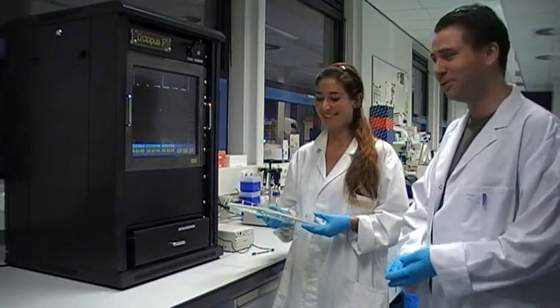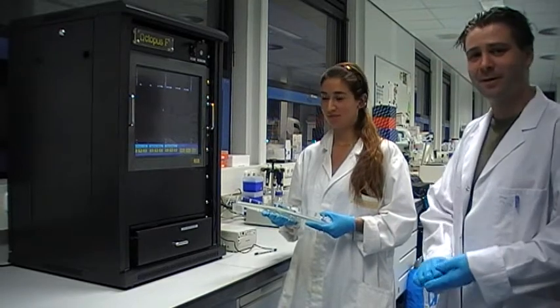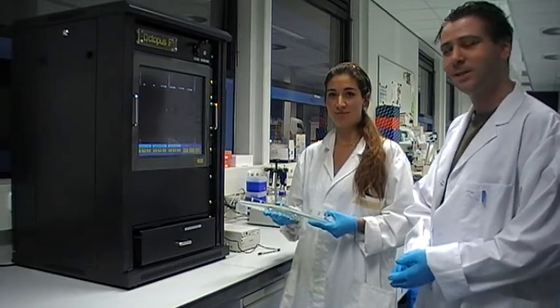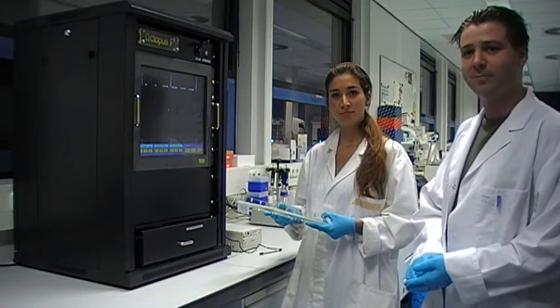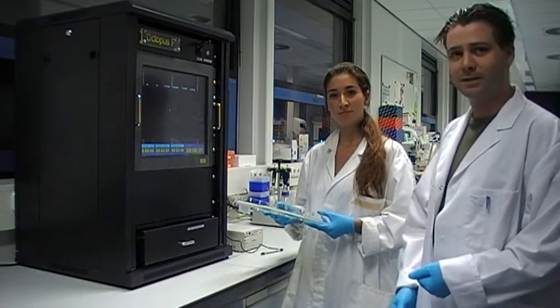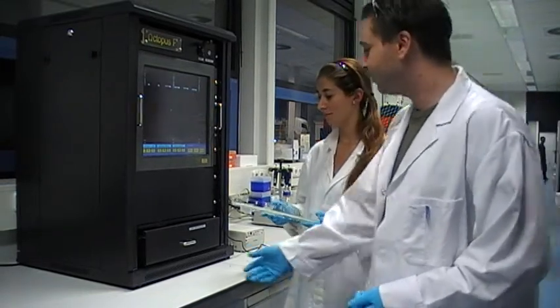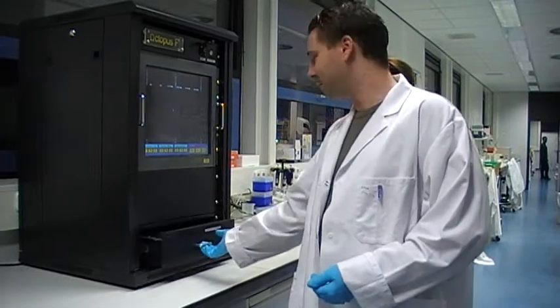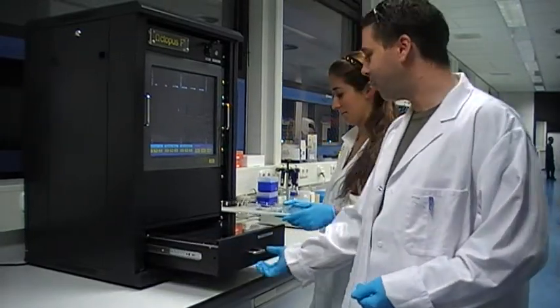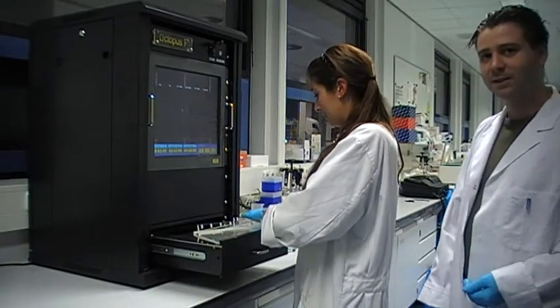is going to help us show how easy our octopus imaging system works. It's now being used by more than 100 people in this lab, and it's designed for speed and also for very large DNA gels. So you start by opening the drawer and place the gel inside.